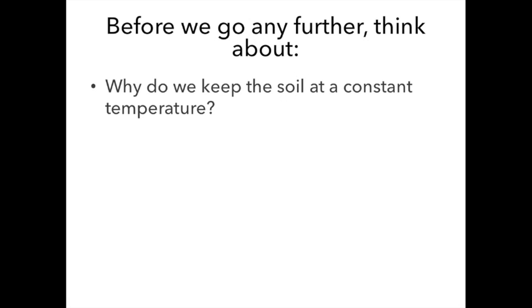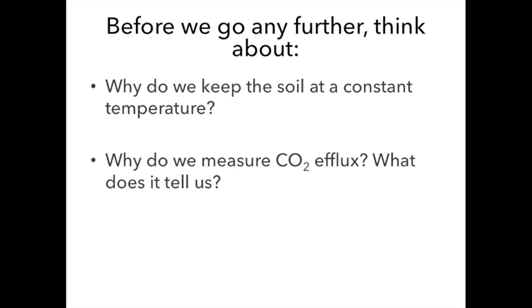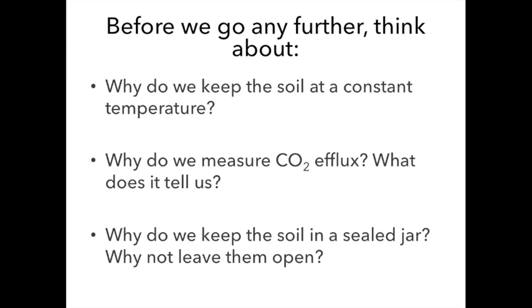Before we go any further, think about, why do we keep the soil at a constant temperature? Why do we measure CO2 efflux? What does it tell us? Why do we keep the soil in a sealed jar? Why not leave them open?